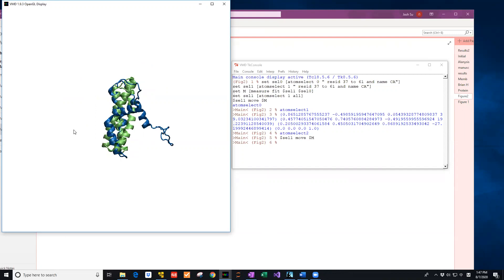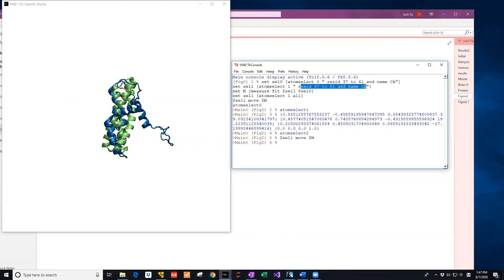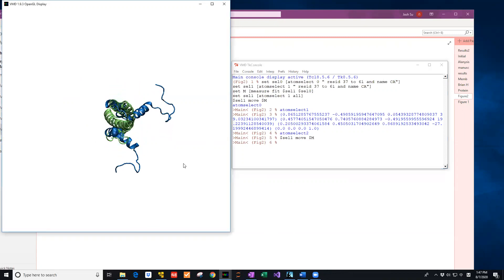If you want to align another part of the protein, what you need to do is change this part of the code. Make sure the two proteins have the same number of atoms. You need to change these two parts of the code if you want to align other parts of the protein together.